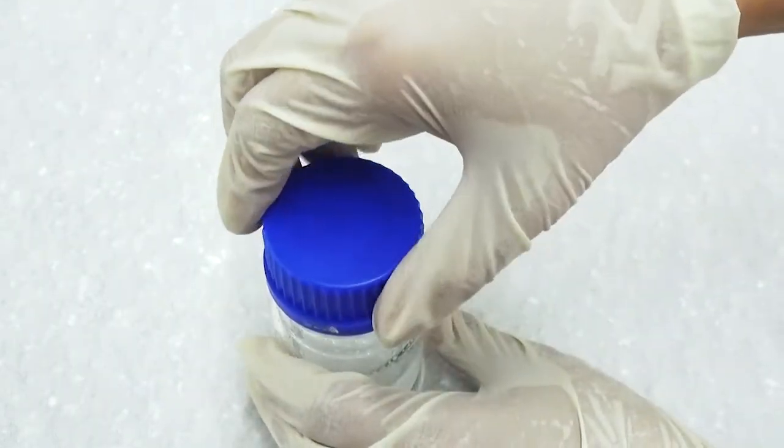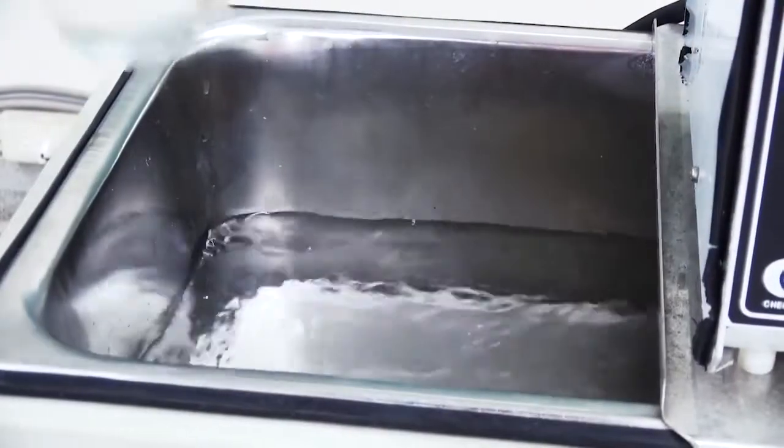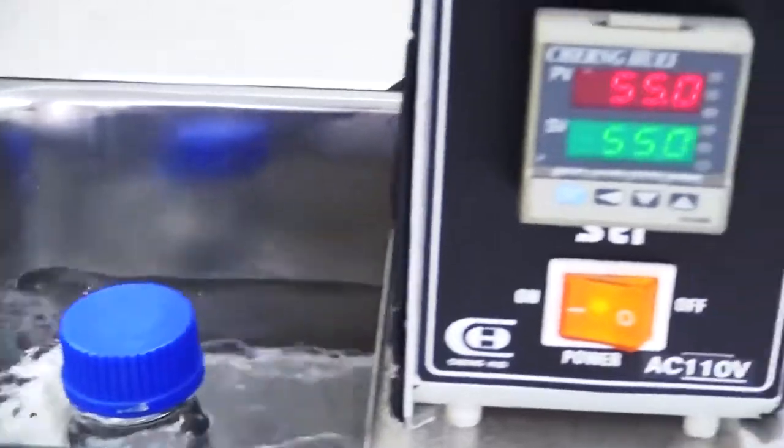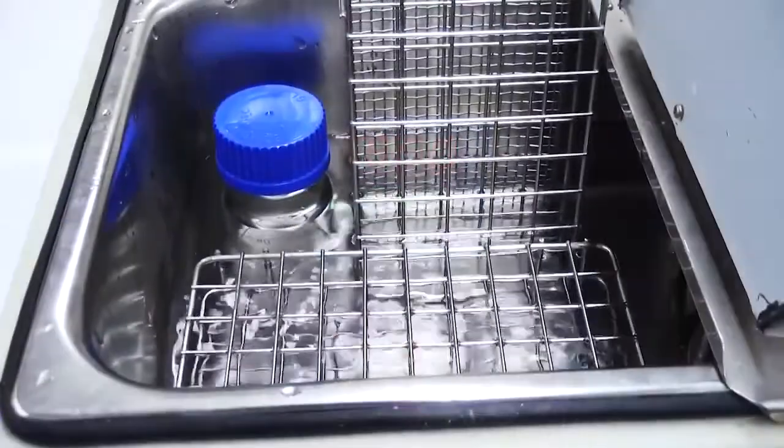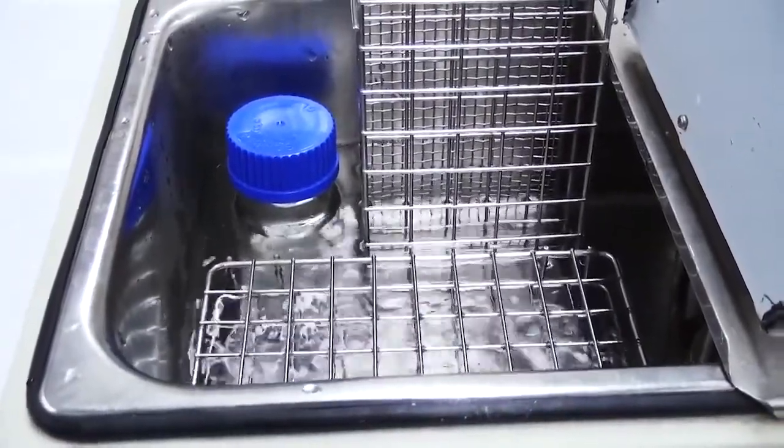Once the agarose powder is completely dissolved, fasten the cap tightly. Place the sealed bottle into the water bath so the solution will cool down to the proper temperature without solidifying. Prevent the bottle from floating in the water bath. Make sure the water bath level is higher than the gel solution level.